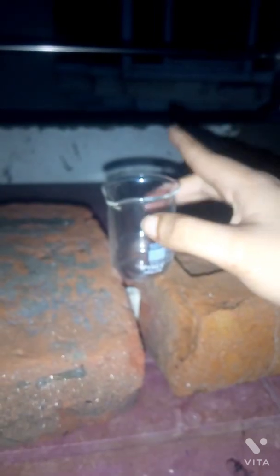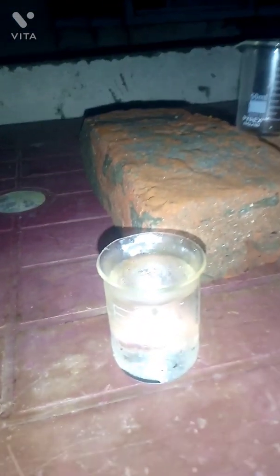I don't have a candle stand right now, so I use a beaker. I use a 50 ml beaker, which I put there, and in the other beaker we have about 50 ml of cold water. Now I use the iodine.